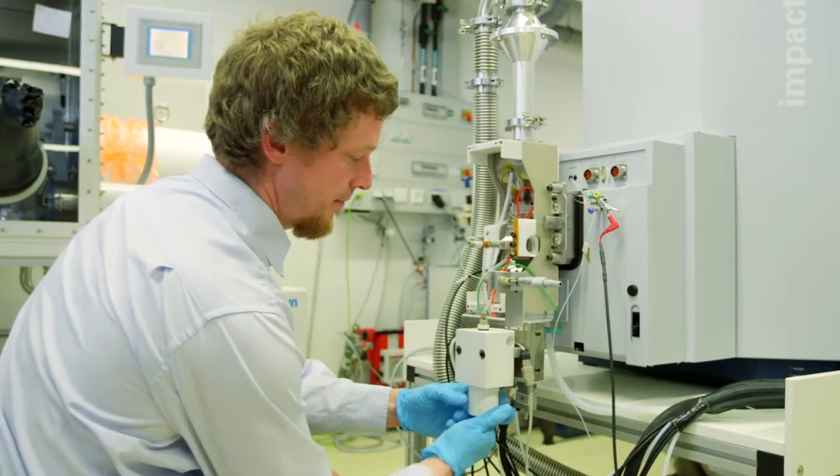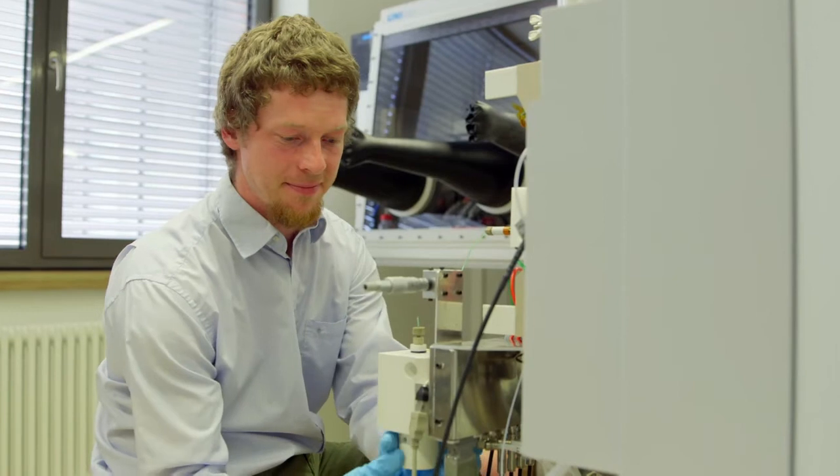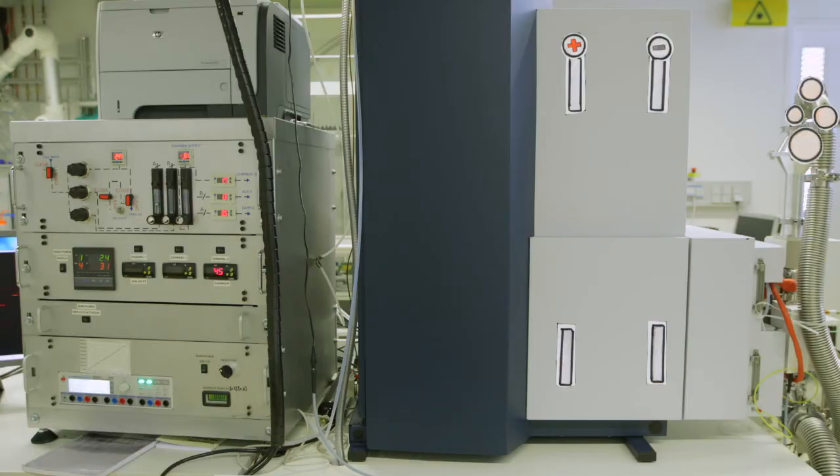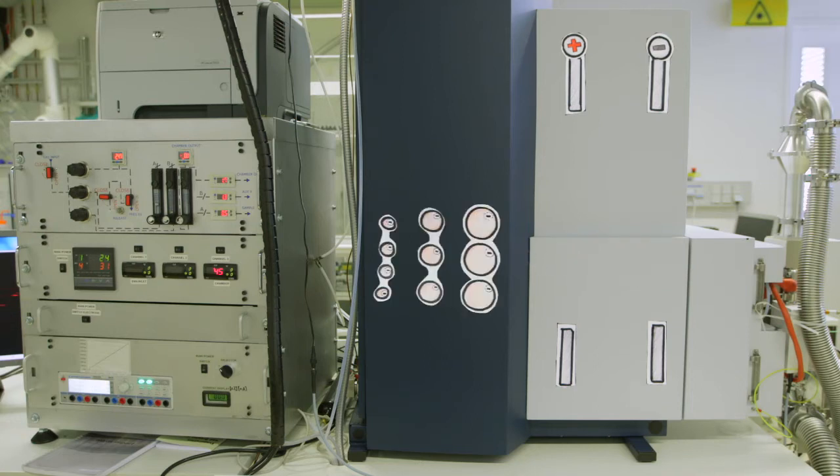Christian Lubert studies the analysis of nanoparticles by mass spectrometry. In contrast to optical instruments, an ion mobility mass spectrometer outputs the mass-to-charge distribution of mobility classified particles. This distribution provides information about particle properties such as chemical composition, shape, and stability.